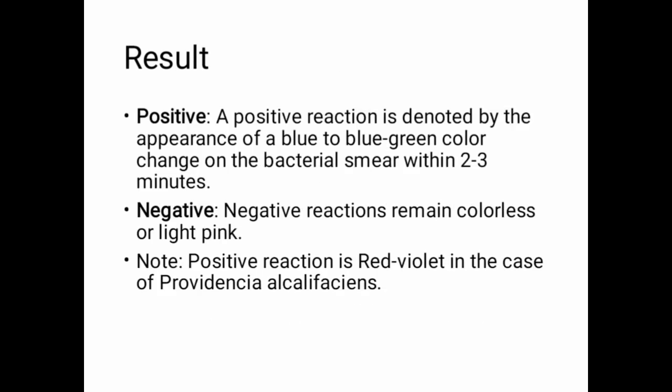A positive indole reaction is denoted by the appearance of a blue to blue-green color change on the bacterial smear within 2 to 3 minutes. In case of a negative reaction, the smear remains colorless or light pink. Another important point is that the positive reaction is red violet in the case of Providencia alcalifaciens.